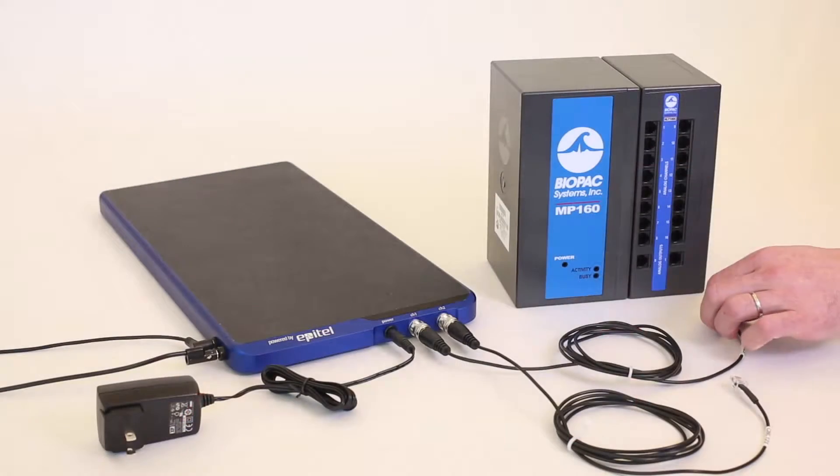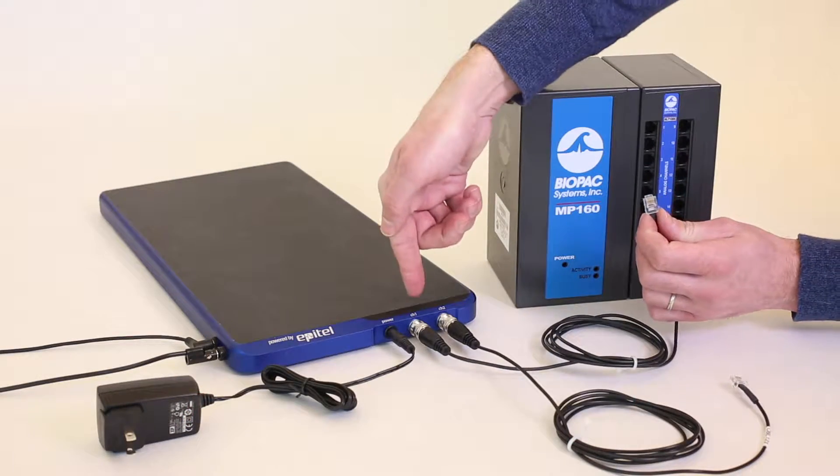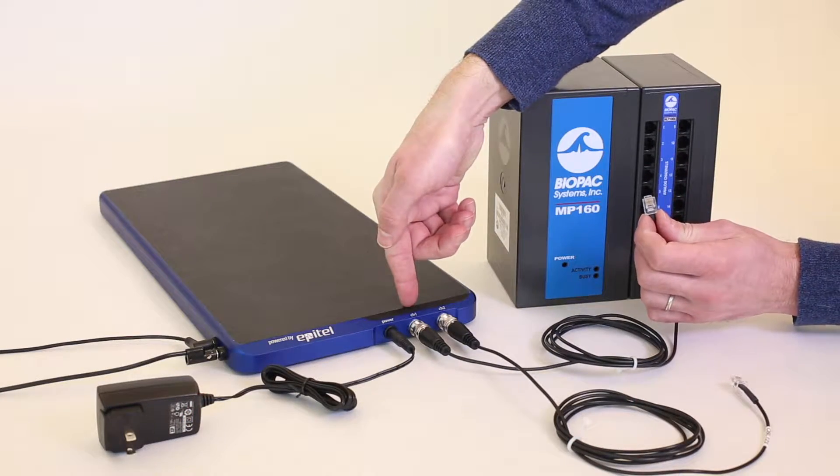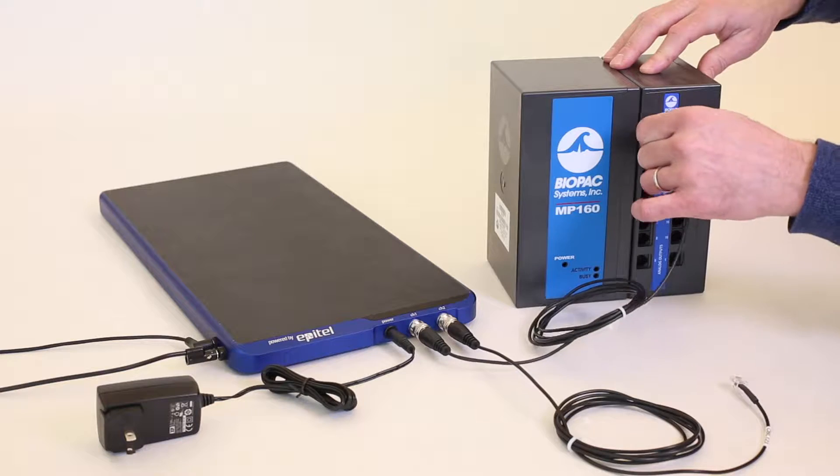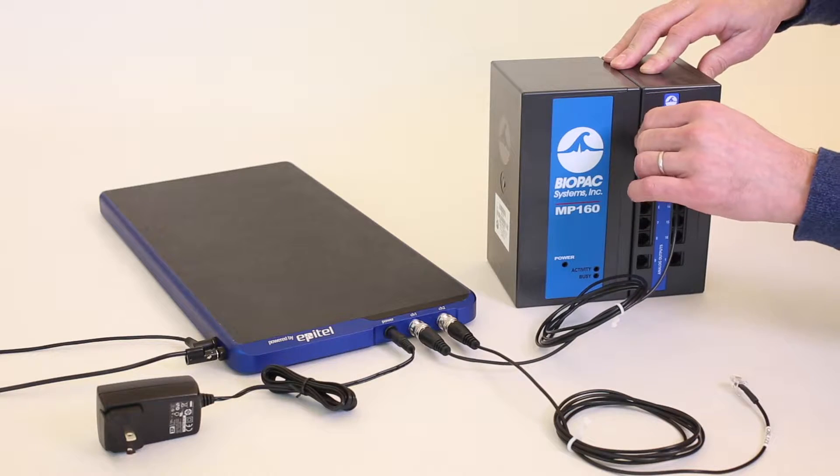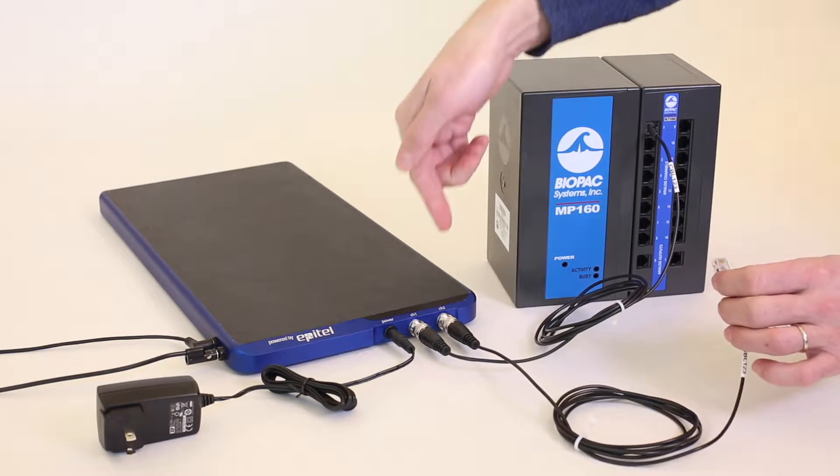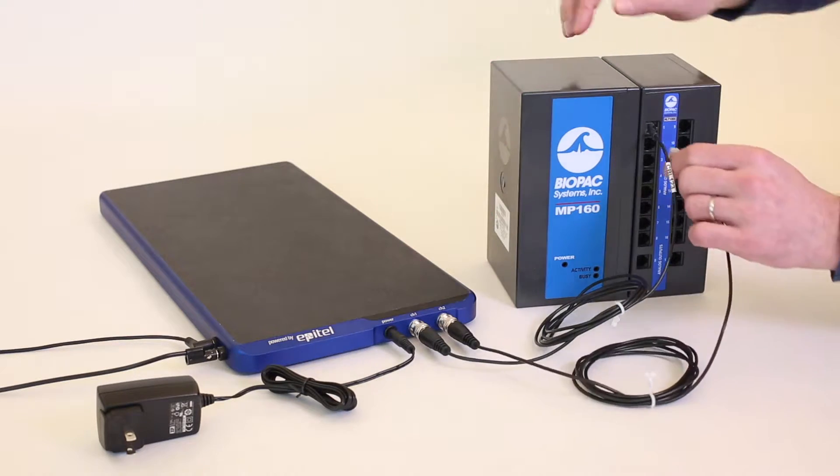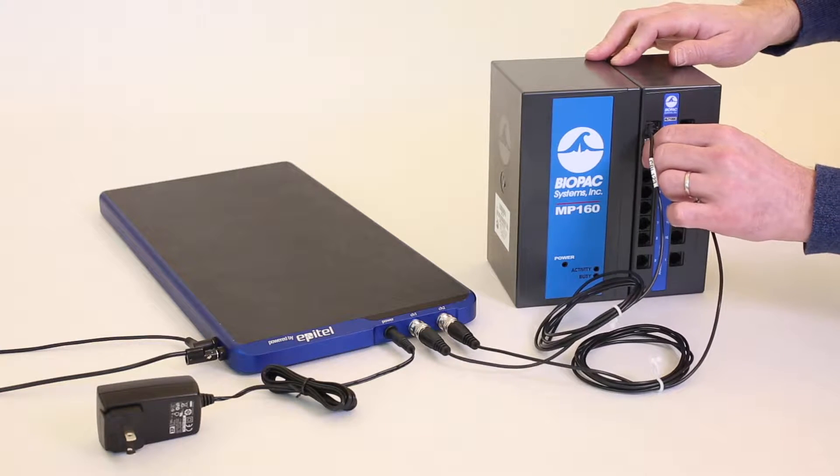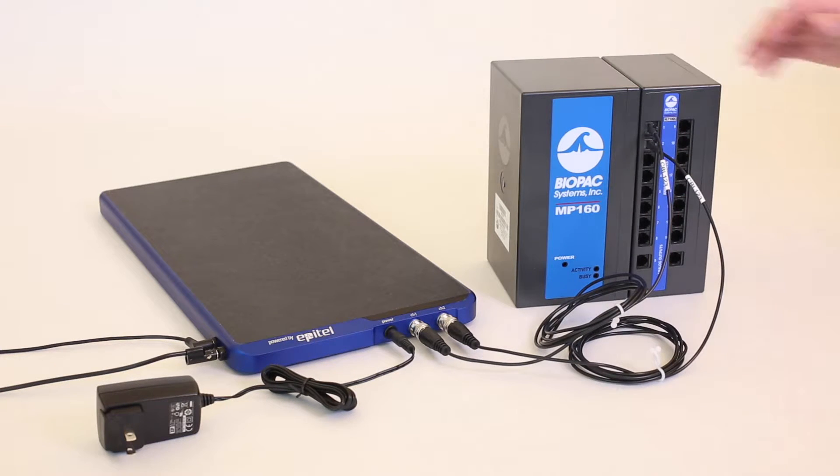The receiver outputs biopotential data via standard BNC connectors for easy integration with Biopac or third-party data acquisition systems. The wireless EPIC system provides a low-cost alternative to cumbersome tethered systems.